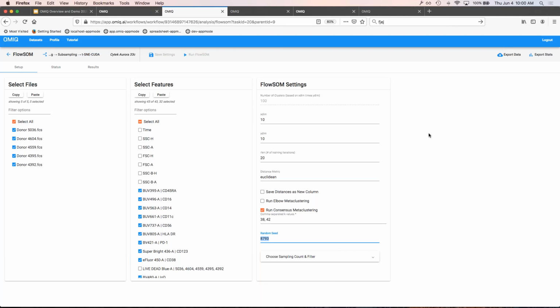Yeah, so we use what I should say is a sort of enterprise standard security. This involves organizational security. At our company, we have a lot of protocols and documentation of our security standards. And then of course, on the technical level, we use end-to-end encryption in flight and at rest. We use all sorts of different virtualization technologies to make sure data are separated, when it comes down to that.